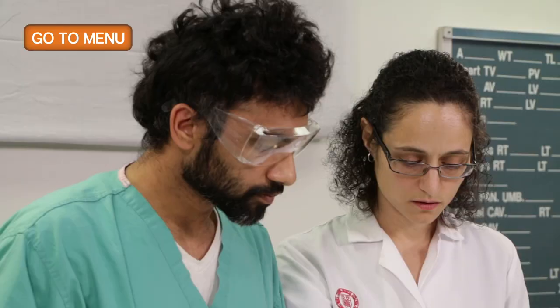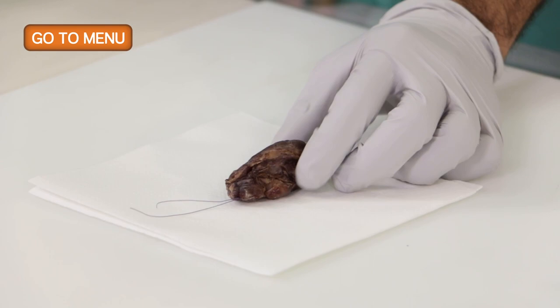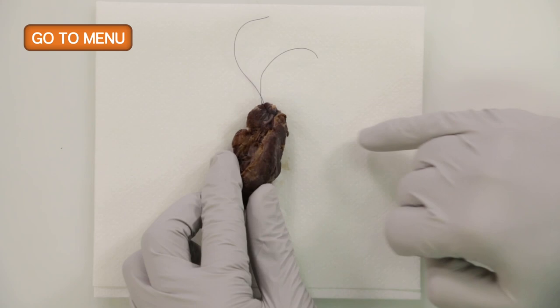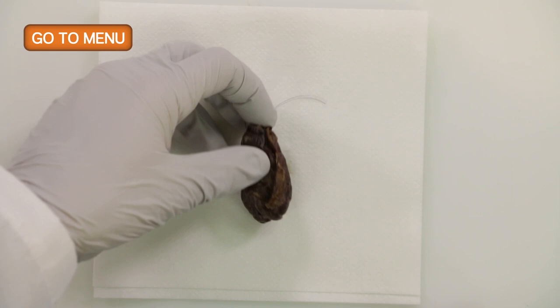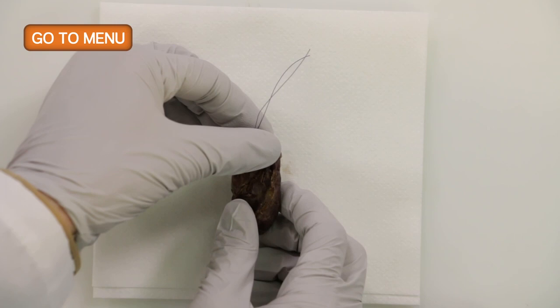So how do you tell the orientation of this? From what I know, the stitch that's up here that the surgeon typically leaves for us represents the superior aspect of the pole of this thyroid. And the isthmus, which is where the surgeon has cut off the lobe, you can see the margin right here, the incision, because there's this cauterized edge. This suture is very important for orientation. It's very helpful that the surgeon puts this here so that we know this is the superior lobe, this is the inferior lobe.